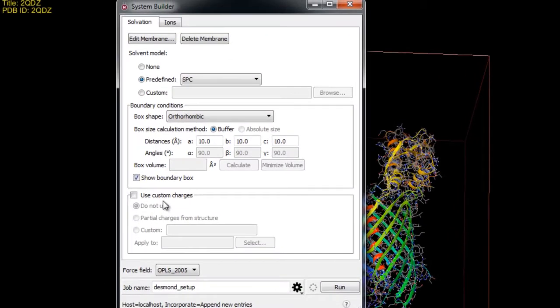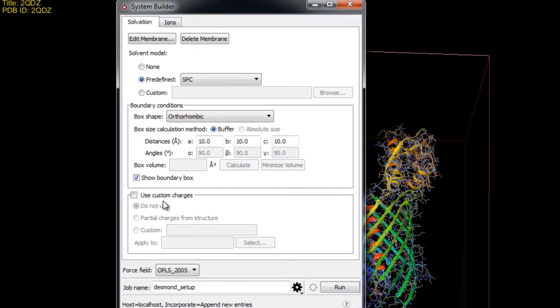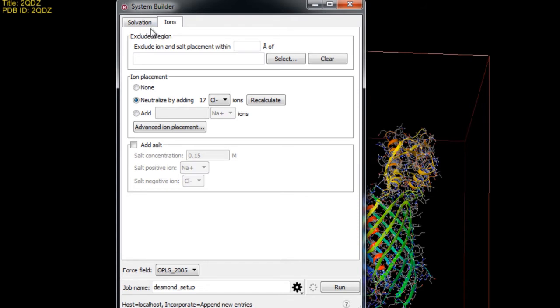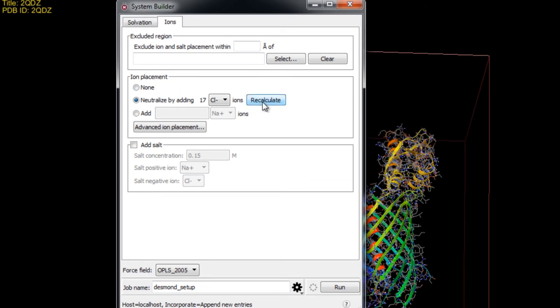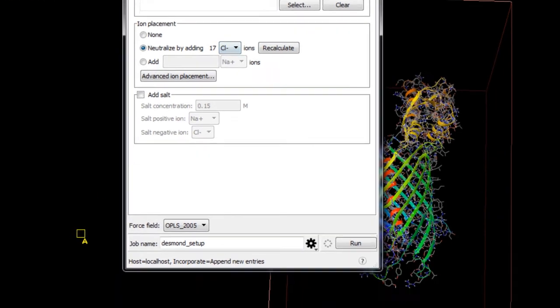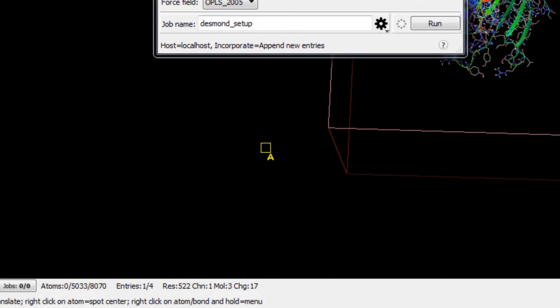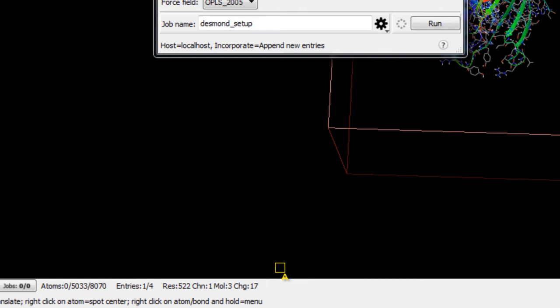We won't use any custom charges but we do need to set up the ions. So let's go to the ions tab. Now if we wanted to exclude a region for example near a ligand binding site from the placement of ions and salts we can do that here but that's not needed in this example. For the ion placement we'll click recalculate to set the number of ions needed to neutralize the system. Here it's saying it will add 17 chloride ions. This makes sense because the set of star down below indicates that the protein has a positive charge of 17.